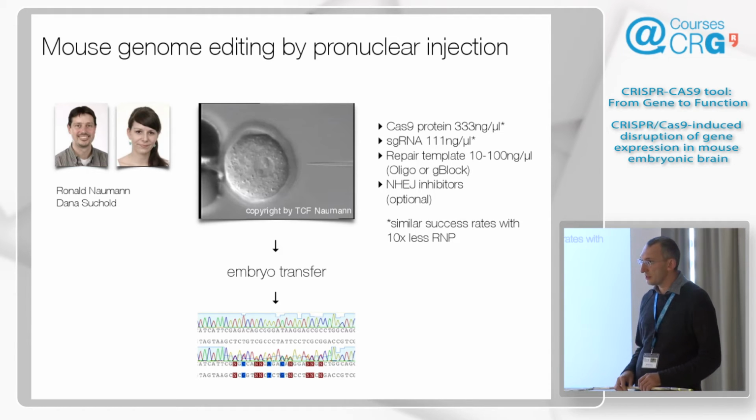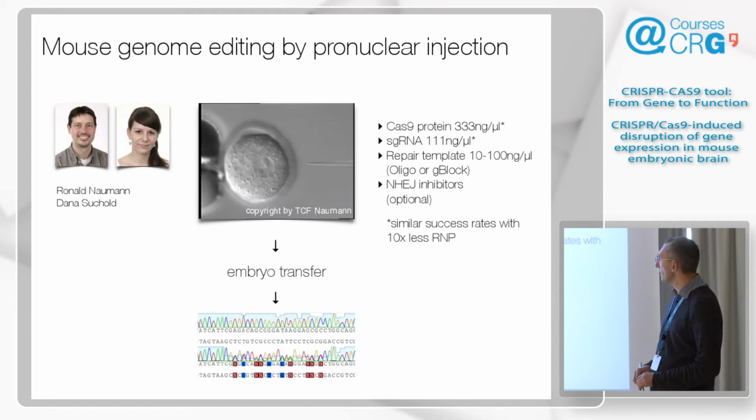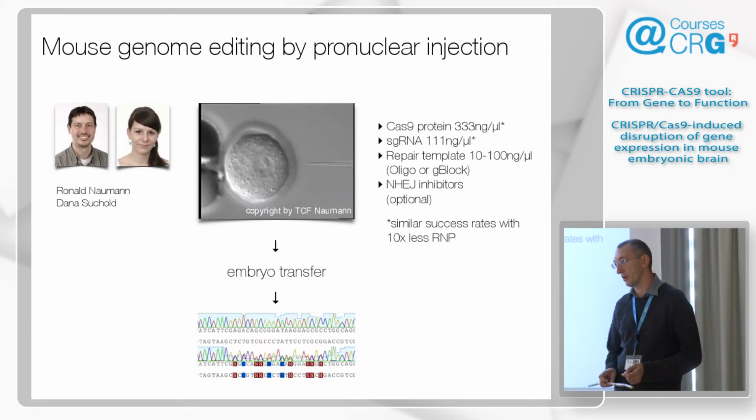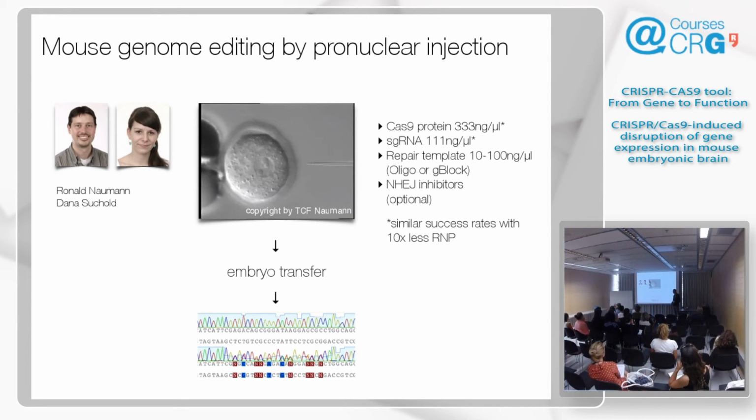Mihail, your Cas9 protein, how many nuclear localization sequences? How many what? Nuclear localization sequences? Oh, okay. So actually, I cannot answer this one for the commercial one we buy, because they don't reveal that. I think it's double NLS. We do have one that's produced by the protein purification facility of the MPI, which we have the sequence of. I could give you this with 2 NLSs, and this works just as well as the commercial one, so we completely switched to it. I don't know if anybody else can get it, but the protocol helped to express it and be functional and soluble. Yeah, you guys have that.